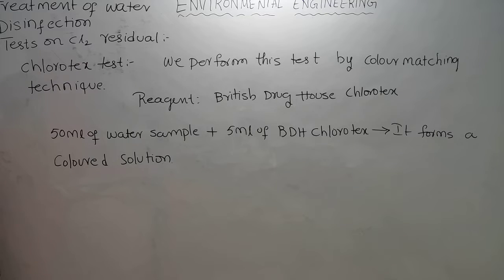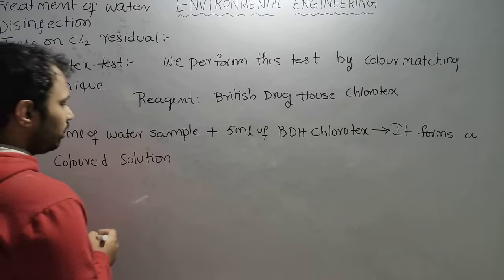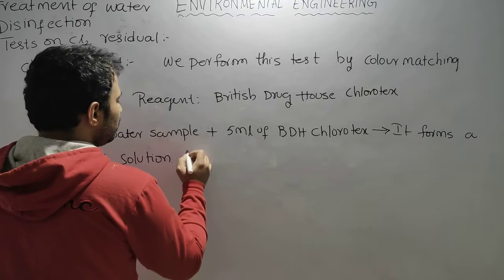The concentration of the color indicates the concentration of the residual chlorine. Generally, a pink color is formed.